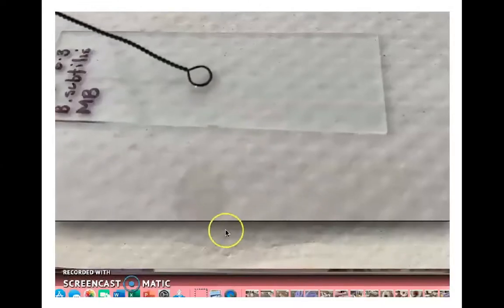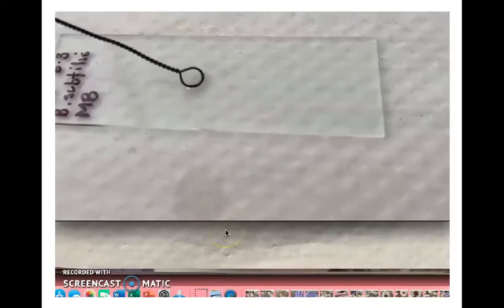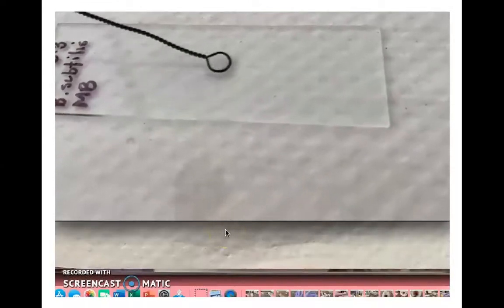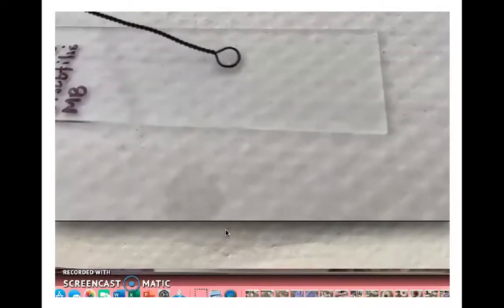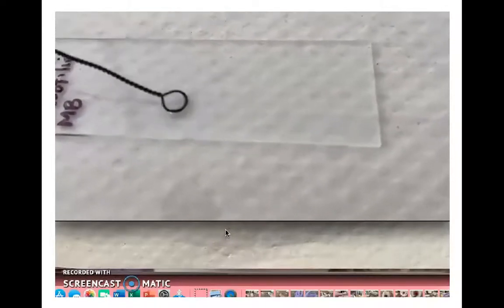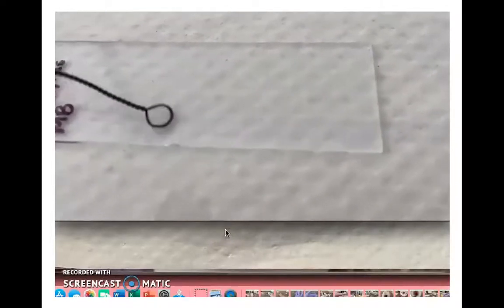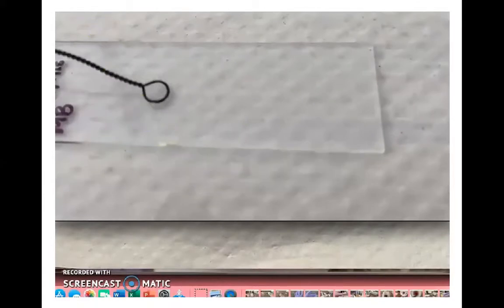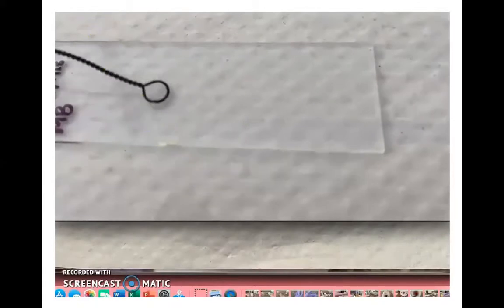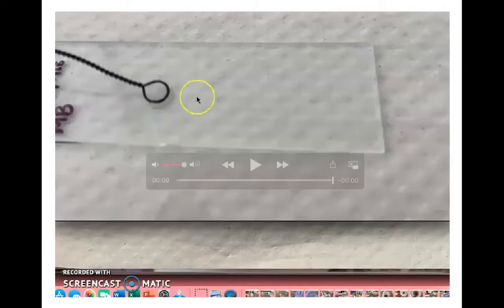Once you have culture on your inoculating loop, place that culture onto your glass slide, making circular movements getting ever wider, spreading the liquid out across the center third of the microscope slide. Then allow the culture material to dry.